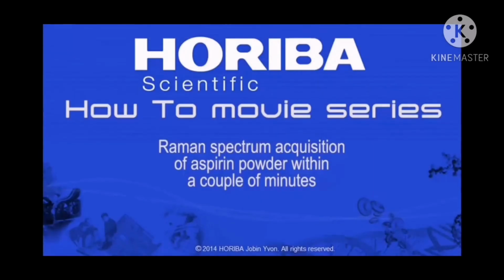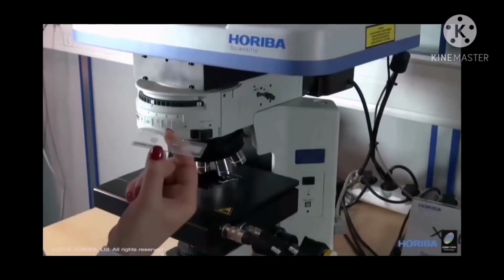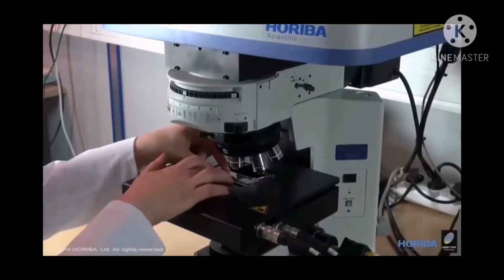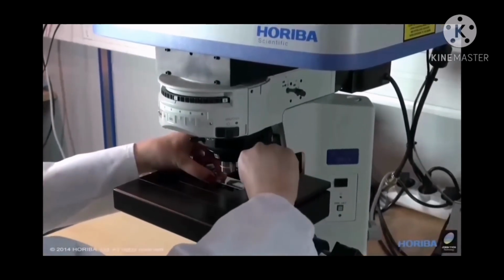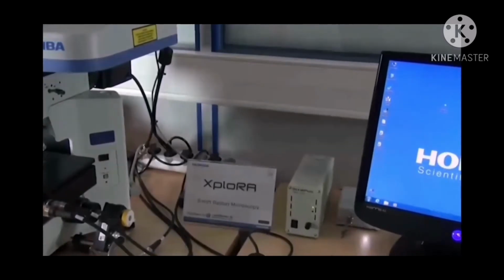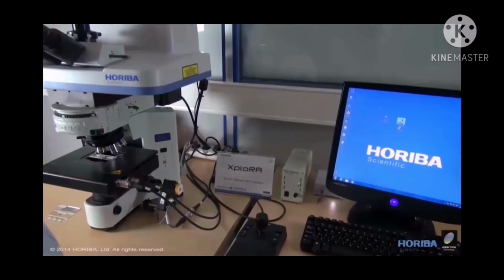In this second video, we'll show you the technique when using a Raman microscope. The sample used in this experiment is aspirin. The sample was put on a slide before being loaded onto a sample holder. Then the slide is pushed to the end so that it can be clamped by a steel clamp. Also, in this experiment, software called LabSpec 6 is used. Then the video mode was chosen.